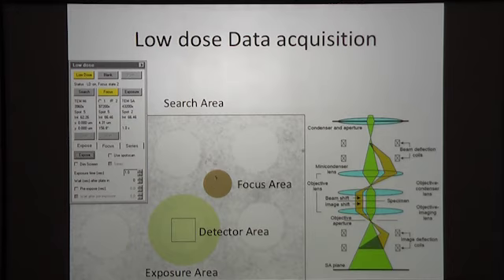So your focusing occurs here, and then once you focus, the beam comes back down to the optical axis and collects an image at whatever conditions you specify here. It usually, the speed is maybe, depending on how you do this, 1 or 2 images per minute. So some people here at LMB were really fast at collecting data this way.